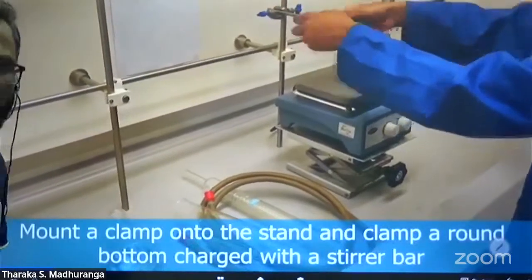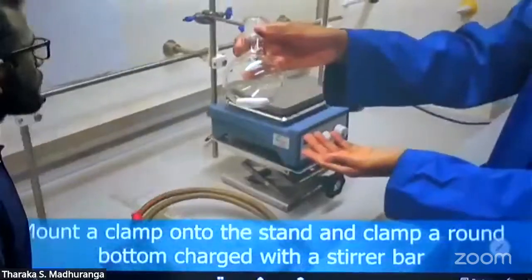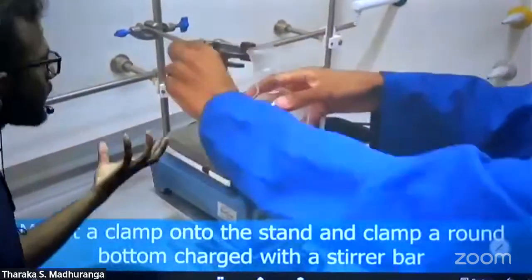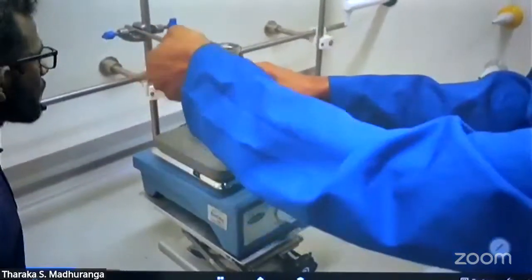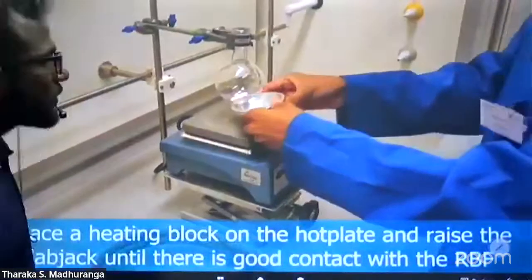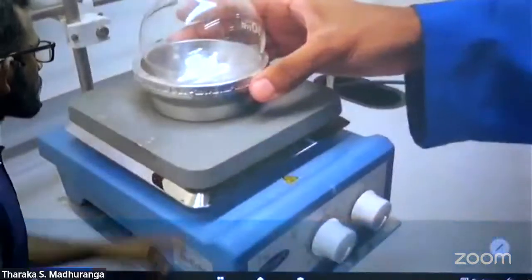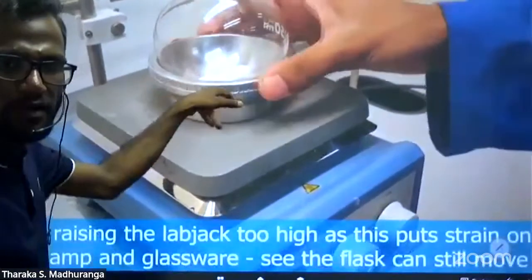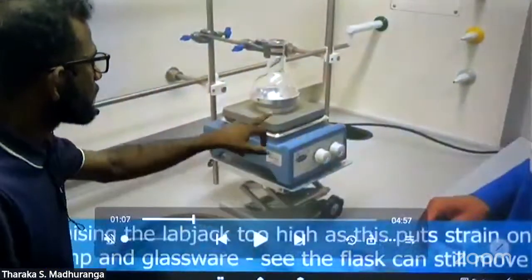The supporter we need to join for connecting the required instrument. That's a solvent chamber. That's a heating support.